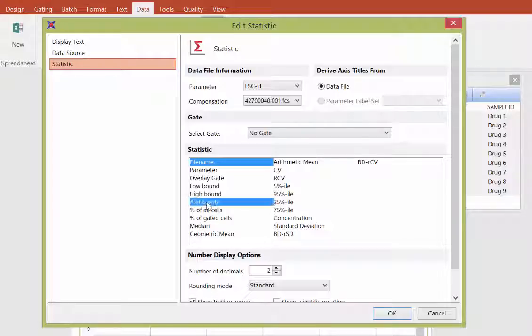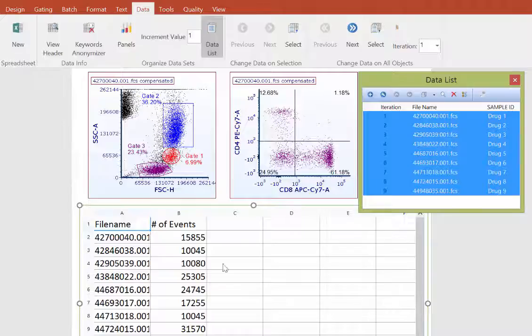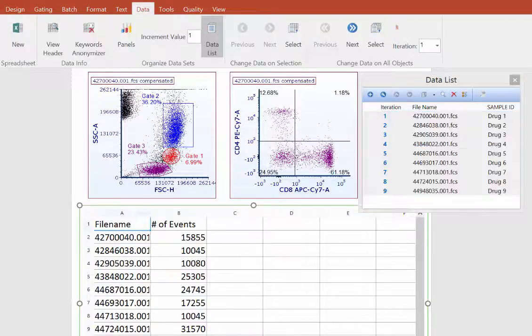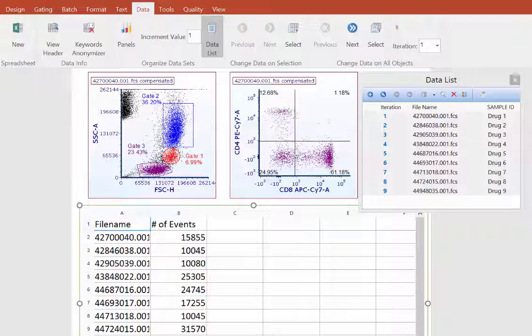the spreadsheet will be populated with this information. If you'd like to add additional statistics to the spreadsheet, simply drag and drop from the data list into a new column in the spreadsheet.